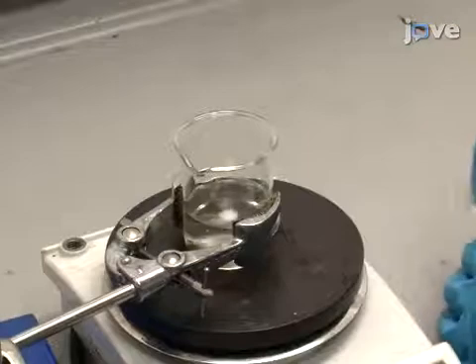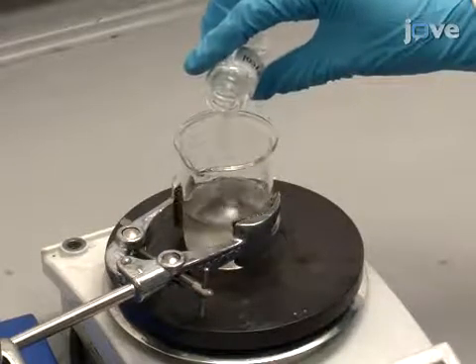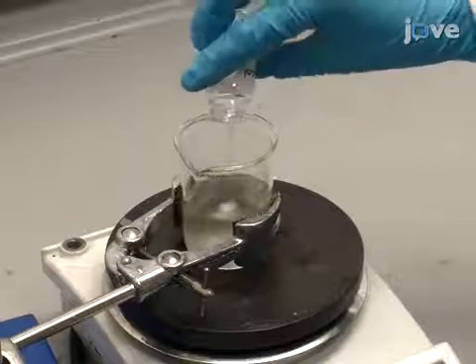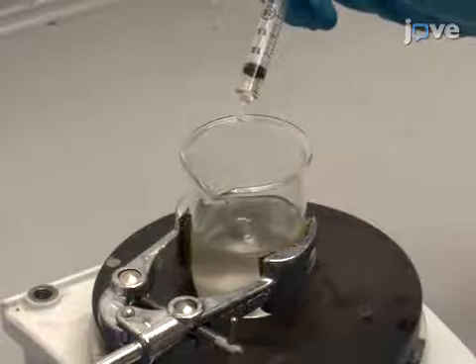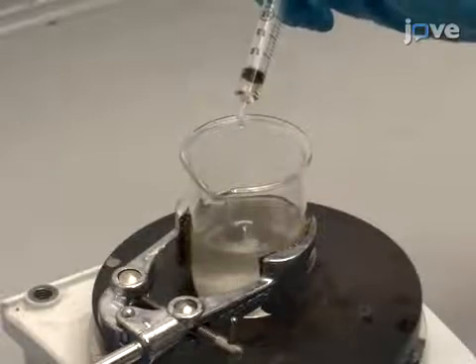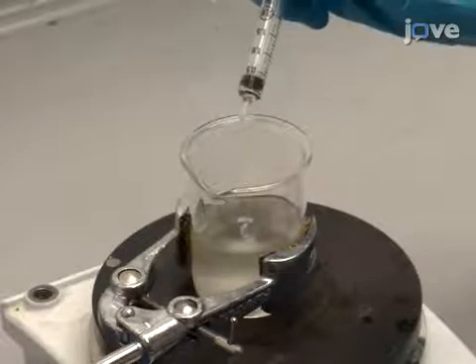To prevent the ink drying at the printing nozzles, add 10 grams of ethylene glycol to the mixture to act as a humectant. Continue by adding 0.5 grams of a defoaming agent, a 20% solution of acetylenic diol and methoxypolyethylene glycol, to prevent air bubbles from developing.